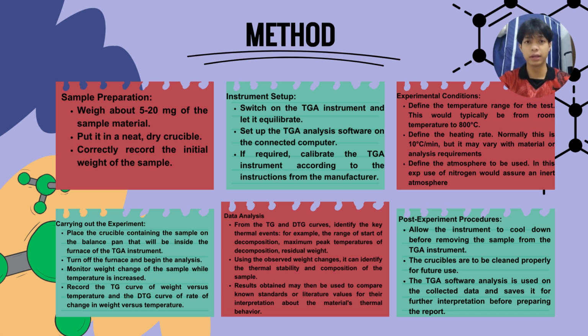Finally, we move on to the post-experiment procedure. We allow the TGA instrument to cool down before removing the sample. The crucible is cleaned thoroughly for future use. The collected data is analyzed using the TGA software, saved for future interpretation, and used to prepare a detailed report.